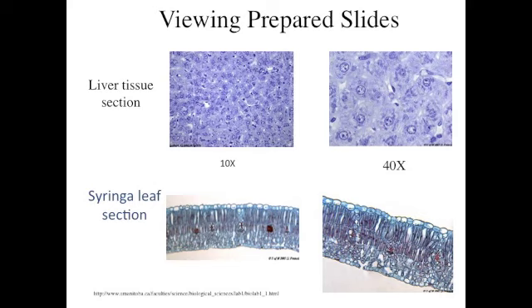There are different types of prepared slides that we can view. You guys are going to be viewing a few in class. These prepared slides are usually tissue that's first killed and then fixed in some sort of preserving material. It's then infiltrated and embedded in a sort of plastic called paraffin, and then the resulting block, this tissue in this plastic, is cut into really teeny sections, and then those sections are mounted onto the glass slide. The paraffin is removed so that all that plastic is gone, and the material is just fixed onto the slide, which allows you to see the light pass through the prepared slide and see the section or the specimen that you're actually looking at.